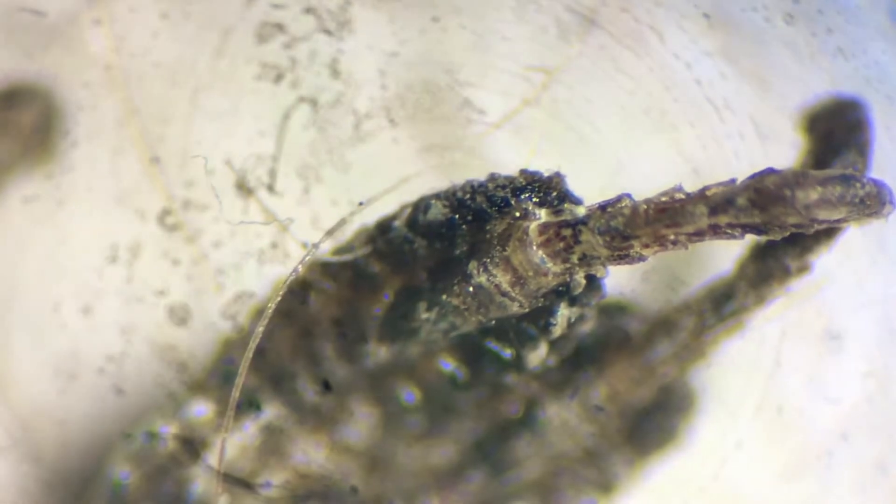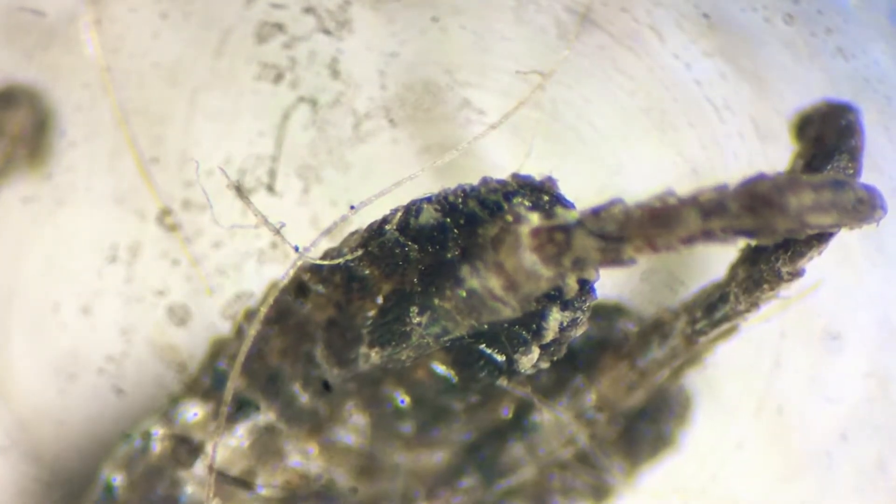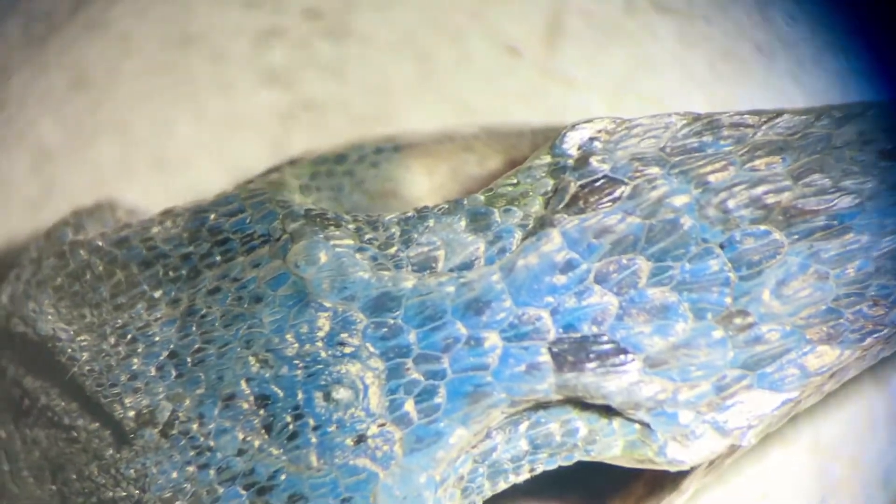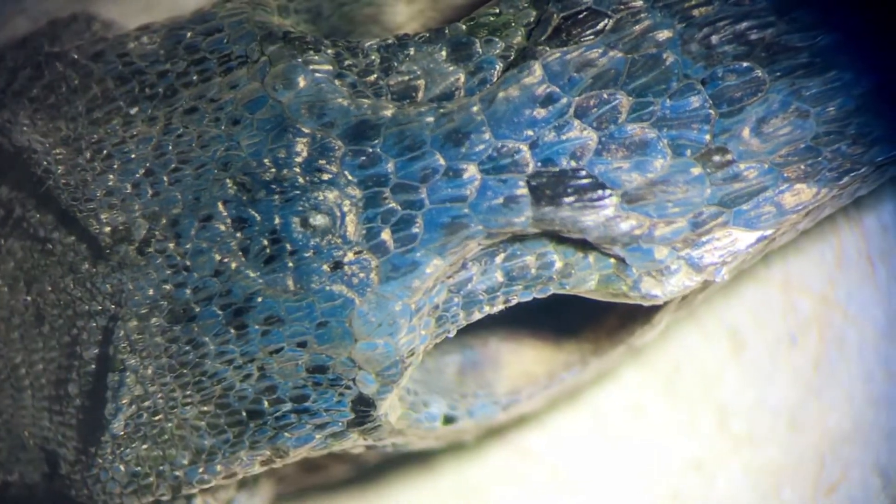Well, I feel bad that the lizard died, but I'm glad for the chance to look at it. Yeah, that's cool — look, you can see his nostrils! His nostrils, boy.